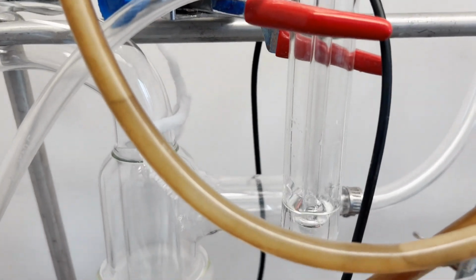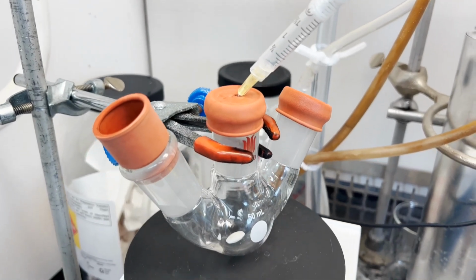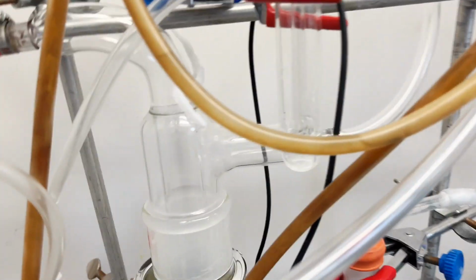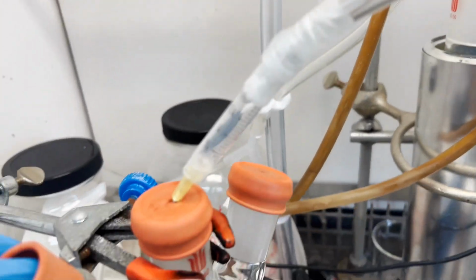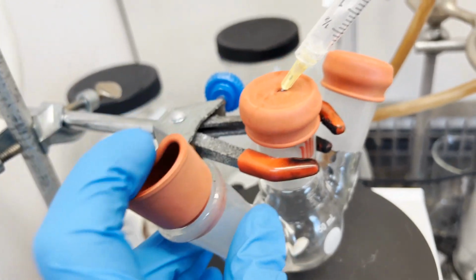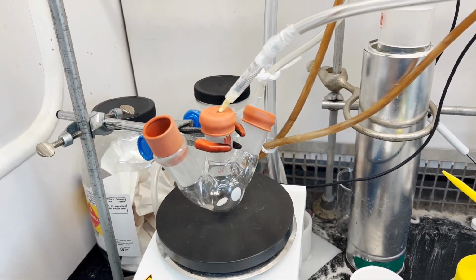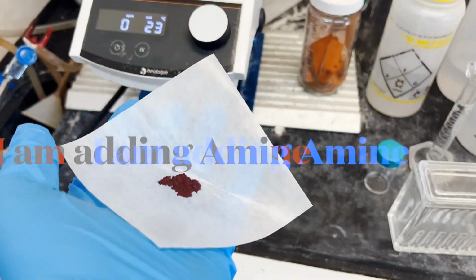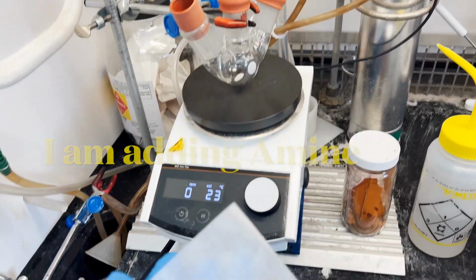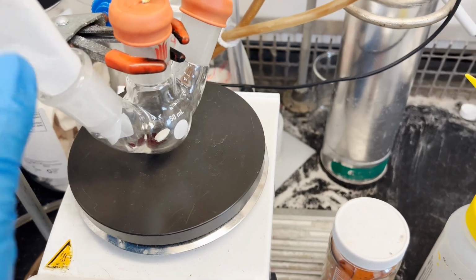This flask is under nitrogen inert atmosphere, so I have connected a tube here and one rubber septum is openable, so that you can adjust or add the solid and other things. You can open it while the gas is on, so it will still be under nitrogen. You can also degas it if you have a double manifold system. So here I have measured the amine. I'm not disclosing what kind of amine and what kind of aldehyde I'm using, so I'm adding the amine here in the reaction flask under nitrogen.